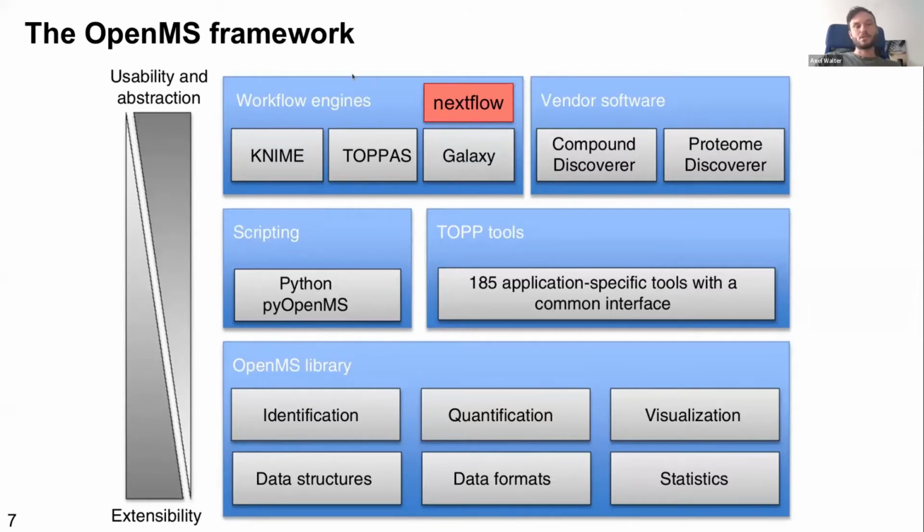If you want to jump in right at the top, at the most usable section here, we also support different workflow engines, such as KNIME, Toppas, Galaxy, and Nextflow, and I will introduce them a little bit better in a minute.